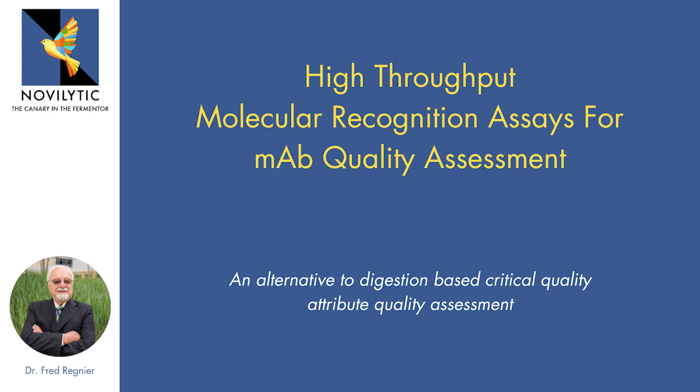Good morning. I want to share with you today some new technologies that we're developing for the analysis of monoclonal antibodies. As we go through it, you'll understand what these terms mean. So one of the things we're going to look at is what we call high-throughput molecular recognition as a way to analyze monoclonal antibodies. It's an alternative to the way people currently analyze monoclonal antibodies and proteins to determine their quality and their biological efficacy.